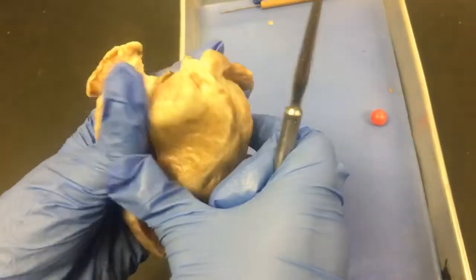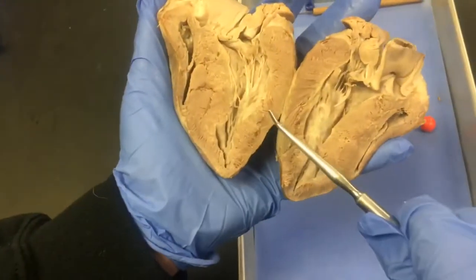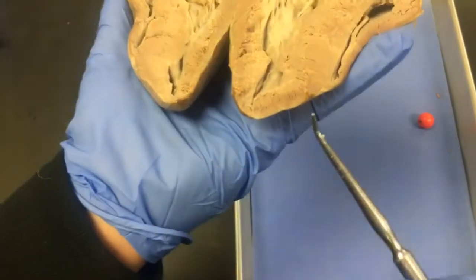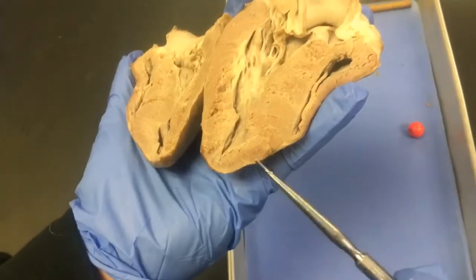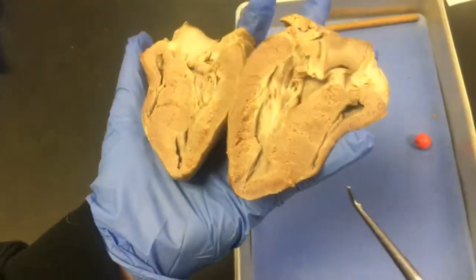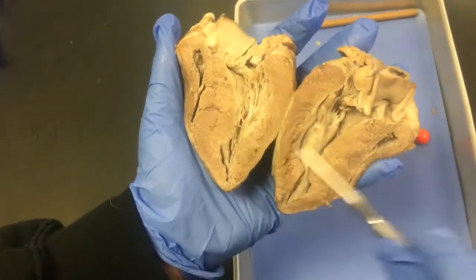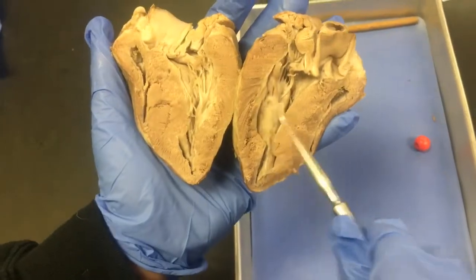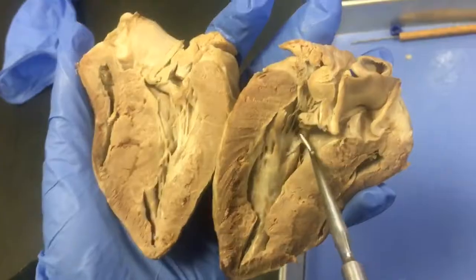And then we have the endocardium, which is right here. No, actually, the endocardium is right here. And then the epicardium is like the outer ridge of the whole heart. And then the myocardium is this fat along here. And then over here we have the papillary muscle. And then these little strings that you see here are the chordae tendineae.